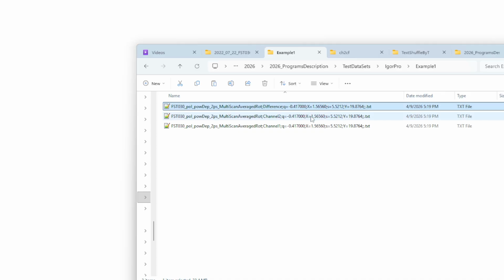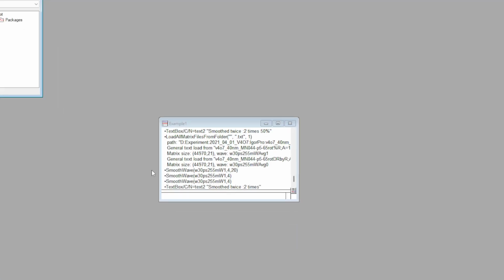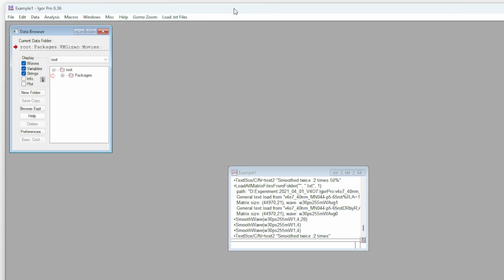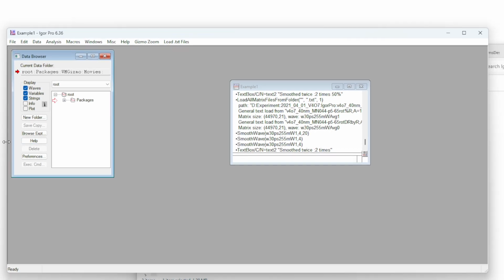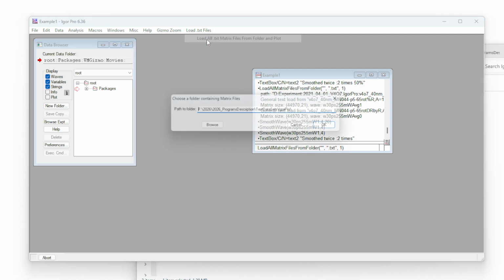And the reason behind this is, let's firstly put the same number and try to open it with IgorPro, and then we see the idea behind this negligible shift. This is what you see when you open IgorPro. So this is an IgorPro window. When it opens, you need to click on load text files and choose the first option. Out of these two, only the first option works.